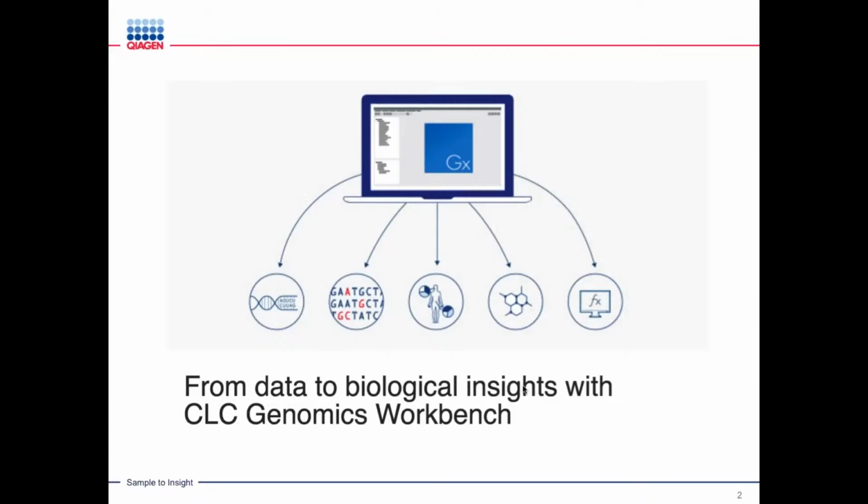And thank you everyone for joining me today for this webinar on the Genomics Workbench, Introduction to Genomics Workbench.